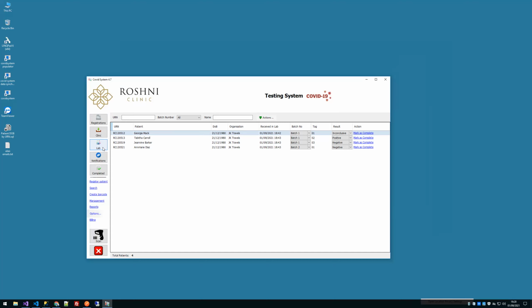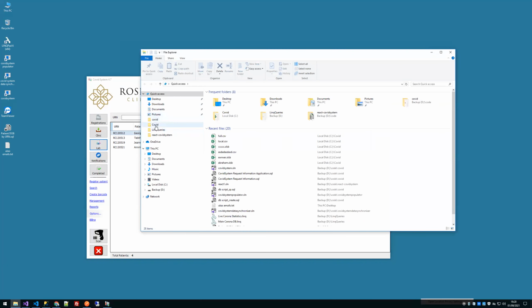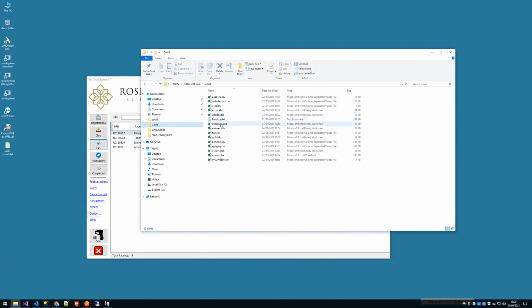And they don't need it, so it doesn't. I think it's for reporting. You have to enter if it's from a red country, an amber country, or a green country. So basically, I'm assuming that they're just doing it manually. Yeah, I think so. All it is for the reporting side of things, if I can open one, they just need to know what country and code they're coming from.